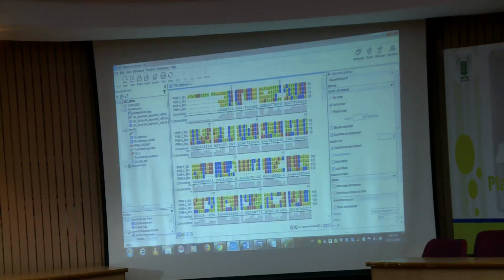So, I will just show you how to do it. Let us suppose I consider this sequence. It started a bit early, but another 3 sequences are starting at a later stage. It is missing around 8 to 10 bases from each, and the others are also not similar. At the beginning I told you that the data at the beginning and end is compromised.